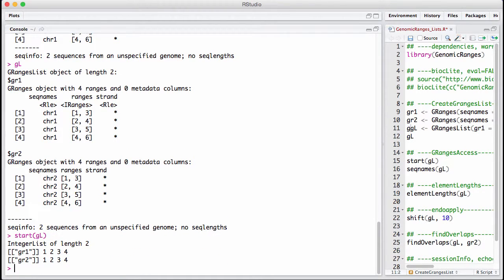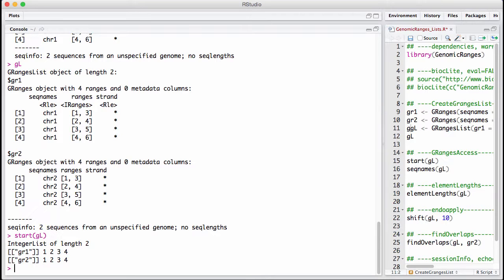Well, we get a list or an integer list where we get this, where for each element, we have the start vector for the gRangers inside that element.